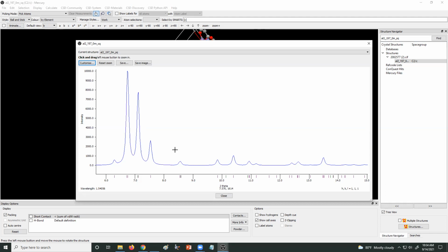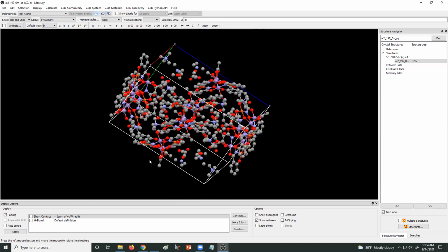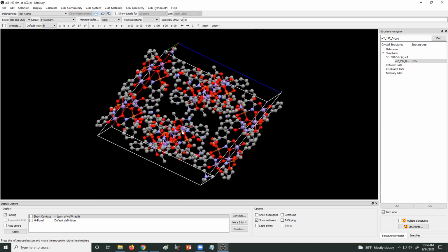And so it should stand to reason that this information can be plugged into the pattern of intense, very high peaks, and low intensity peaks. The pattern of high and low intensity peaks can be used to do a couple of things. It identifies what your unit cell is: you feed that pattern into a computer, and you work backwards. From that information comes a three-dimensional structure of the electron cloud in that crystalline solid, and where electrons are is where X-rays scatter, and that's how they get the structure. I'm assuming that you know how to do screenshots of different orientations to make this look right, because I've asked for a couple of screenshots.